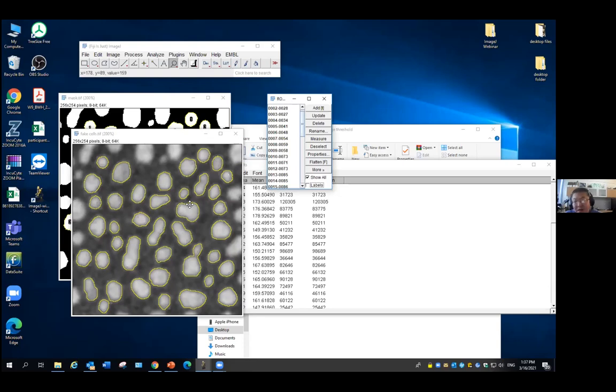If you manually draw it, I would say it takes at least 10 to 15 minutes. But now we just go through an image, adjust the thresholding, play around just to get what we think is best. I apply it, then we go to analyze particles. Then we get there. So now I can save this one.